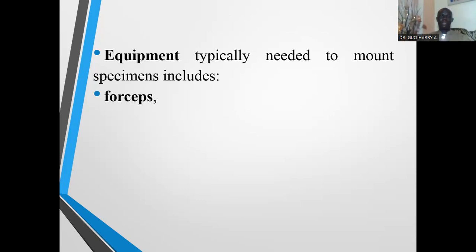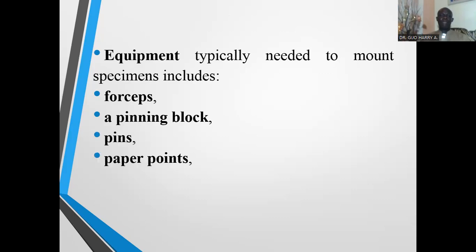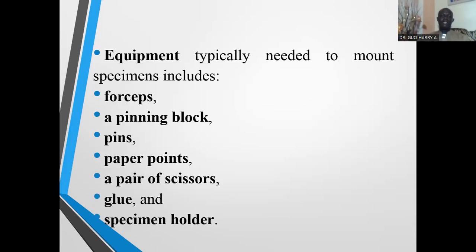Now, what is the equipment for the preservation of the large-bodied insects? Equipment typically needed to mount specimens include forceps, a pinning block, pins, paper points, a pair of scissors, glue, and a specimen holder. These are the equipment that are required: forceps, pinning block, pins, paper points, a pair of scissors, glue, and specimen holder.